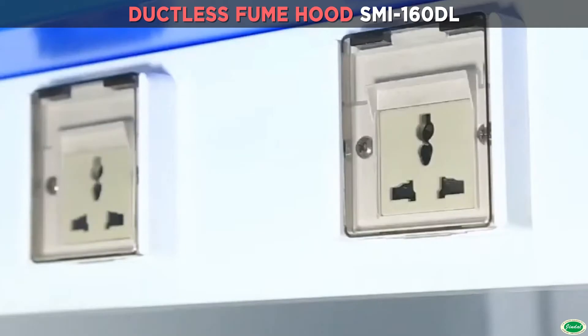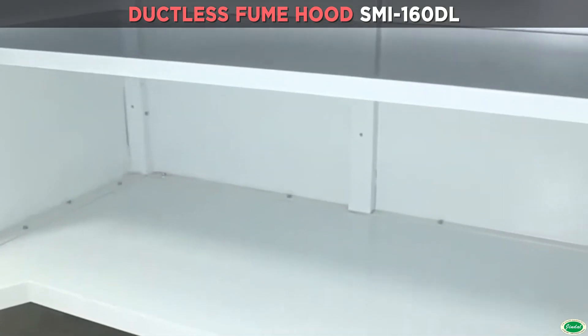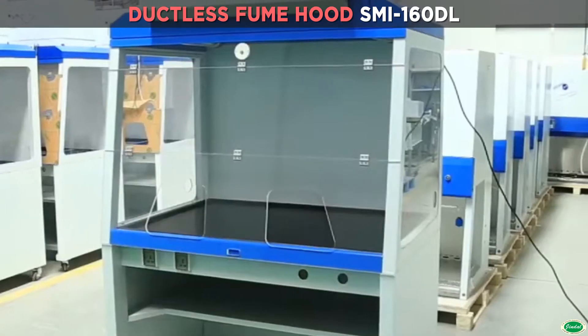Three-side transparent acrylic windows with front window reversal design for easy operation. Double-layer structure with one-millimeter sheet metal surface. Chemical-resistant phenolic resin work table.